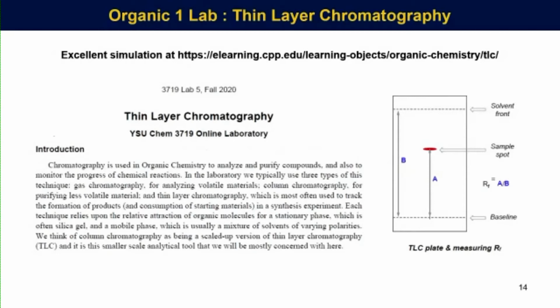LibreText out in California online. They have some really, really nice pages that explain all these techniques. And we borrowed from different places about how TLC works. But then we had them think about Rf and think about polarities, how that relates to where the compound was shown on a TLC plate.